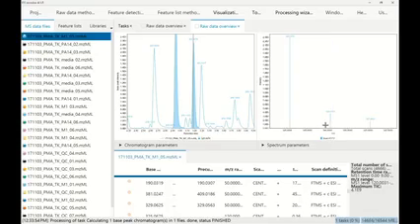This is actually a good sanity check, because I can see now it's a centroid data set, so it's already centroided. And from here, I know that our processing does not need to do centroiding in the first step. If you do have profile data, you have to make sure that you're centroiding the data in MZmine or during the conversion.